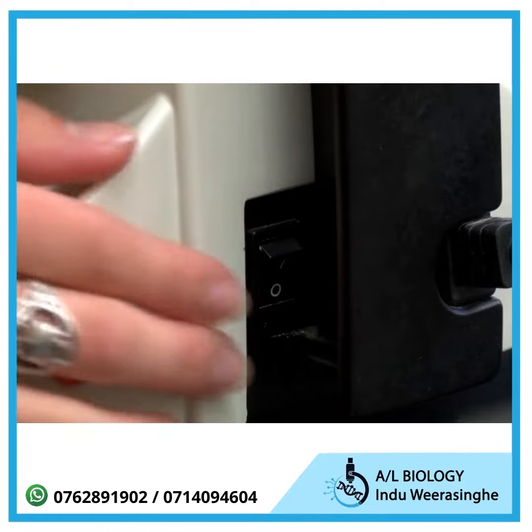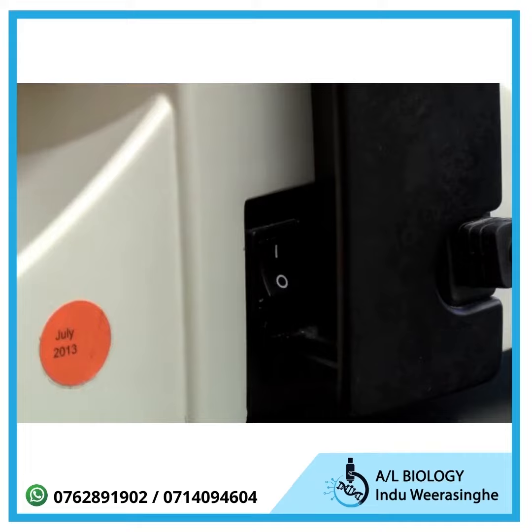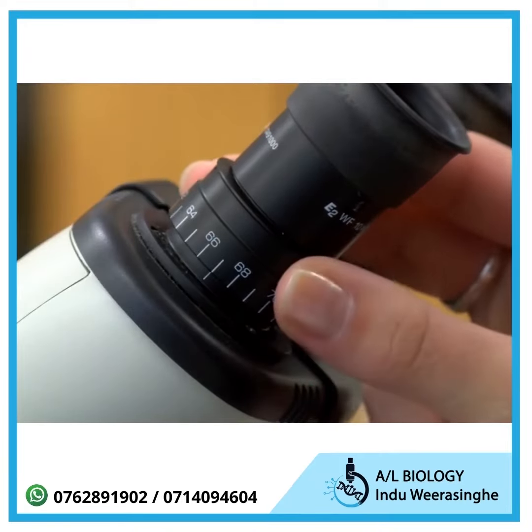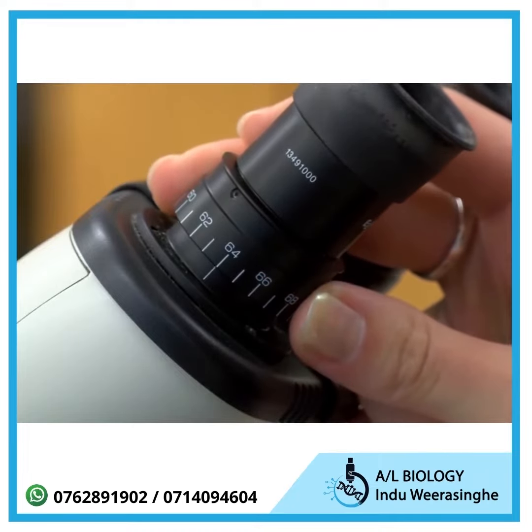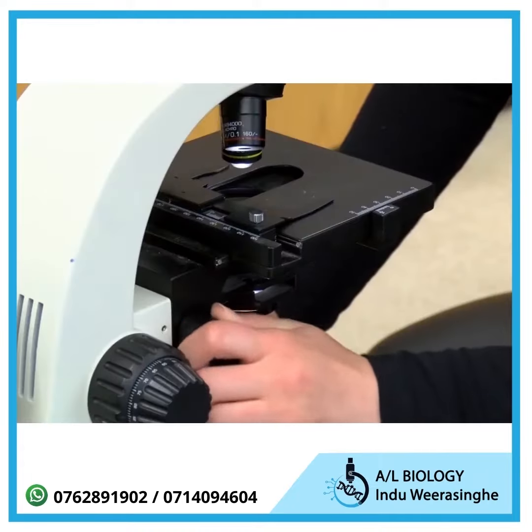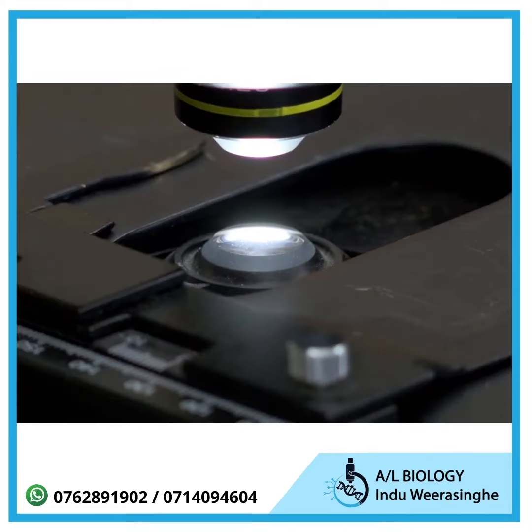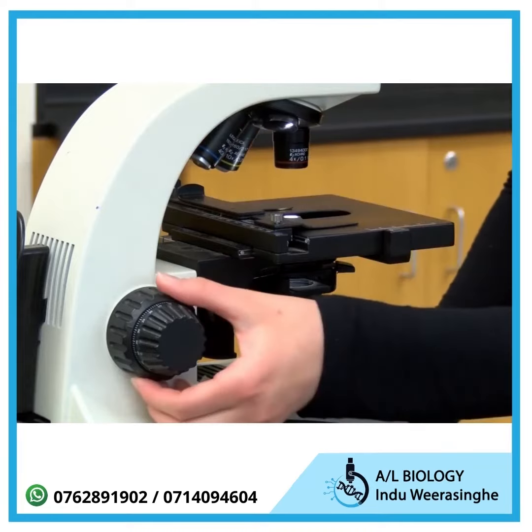The on-off switch is on the back of the scope and may be hard to find if the power cord is still wrapped around the holders. Check the ocular lenses and turn them until the number 64 lines up with the white line below the rotating part of the lens. Check that the condenser lens is just below the stage. Put the objective lens on low power and move the stage to its highest position.